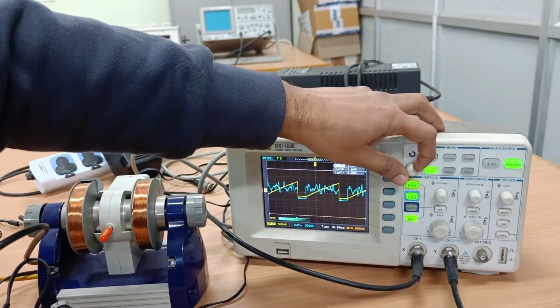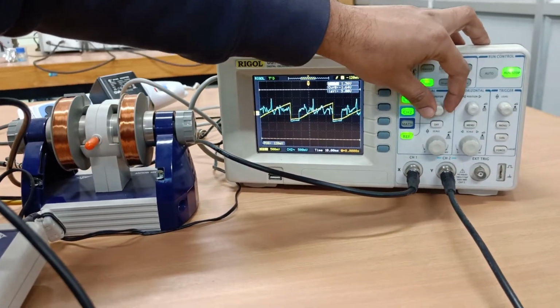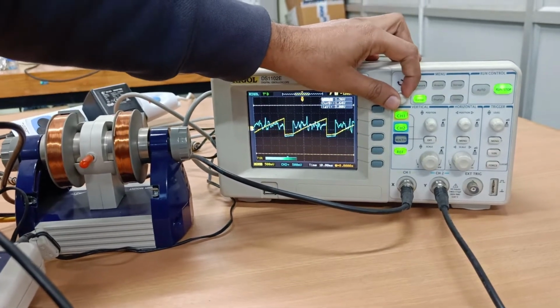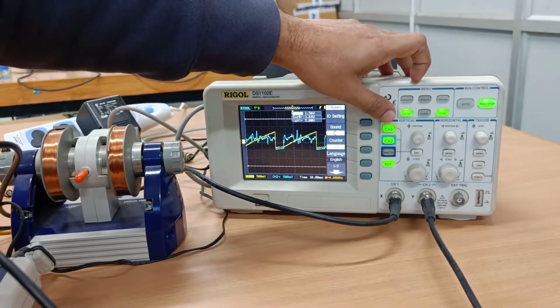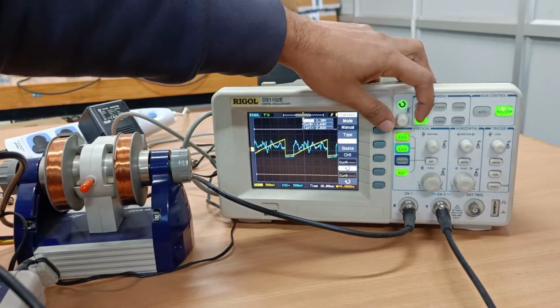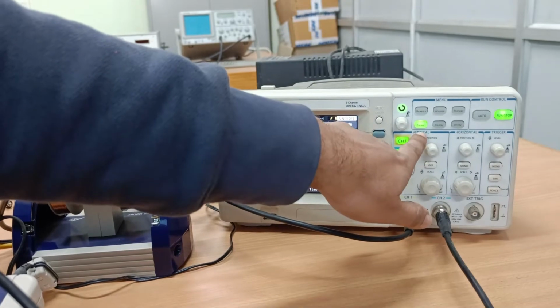The cursor A we can move by choosing the cursor button here.